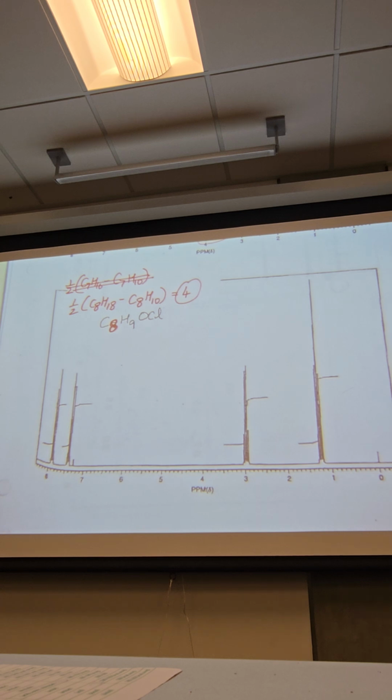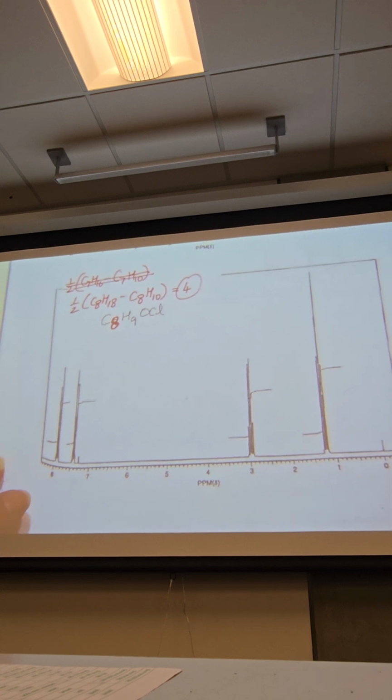Once again, whenever IHT is 4 or above, think about benzene. So is benzene possible here? Yeah. Which is the reason why we were having that initial doubt about the formula. Absolutely. How many signals? 4. Everybody agrees? 4?